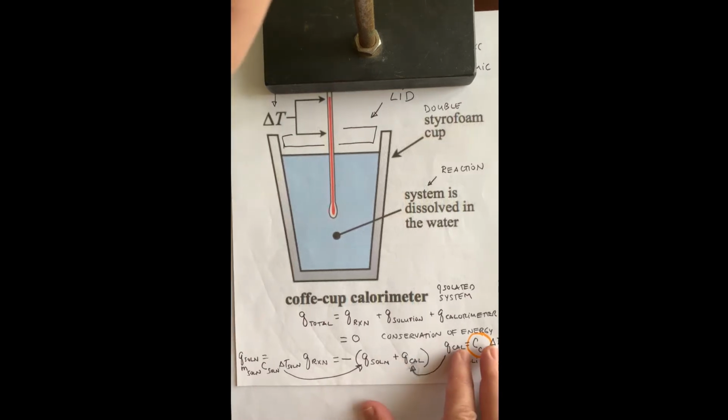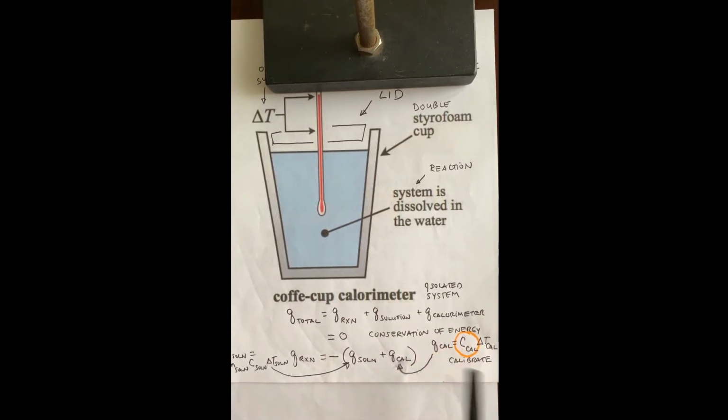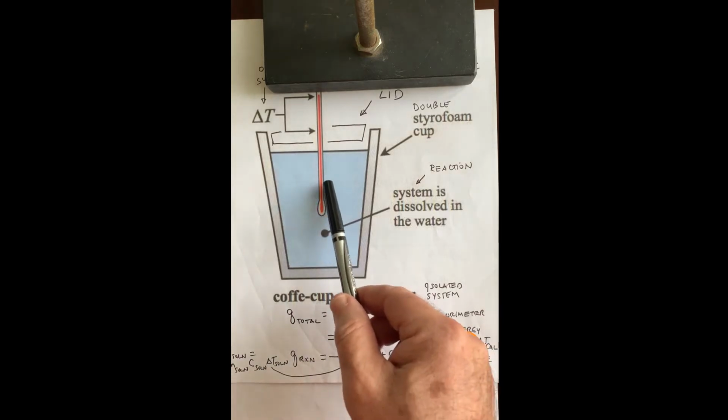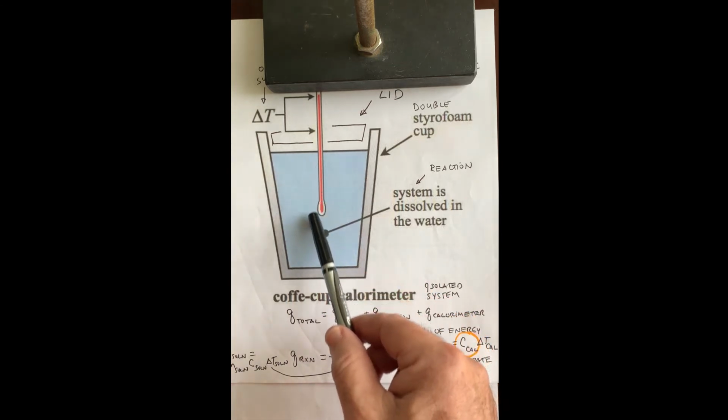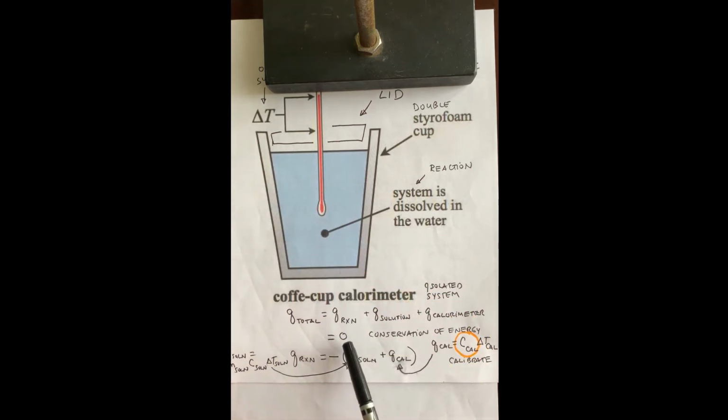Let me roll this a little bit to the side here so we can see it, and we can calculate what that is. So what we're going to do is measure the change in temperature that happens in a solution once we add our metal or our metal oxide, and we're going to use that to calculate ultimately the heat of our reaction. Now, you're going to be given a data sheet. It looks something like this. And if you had the manual, this would be page 39 of the manual.